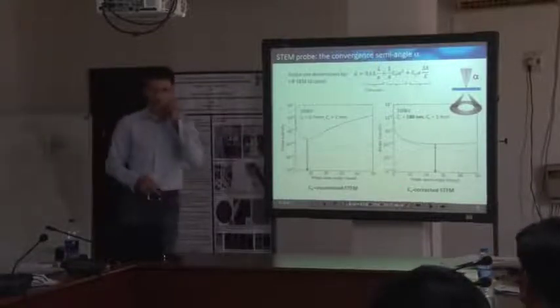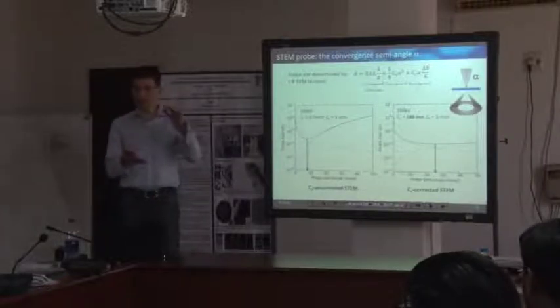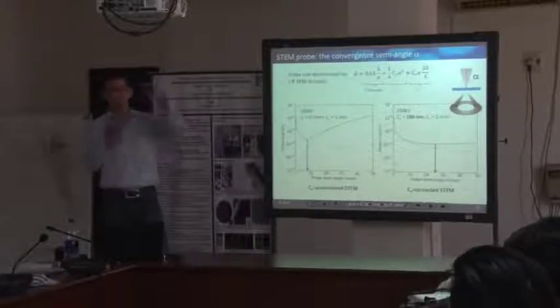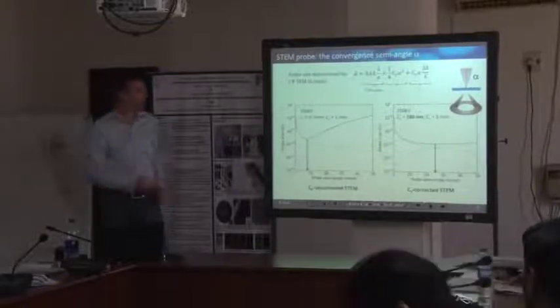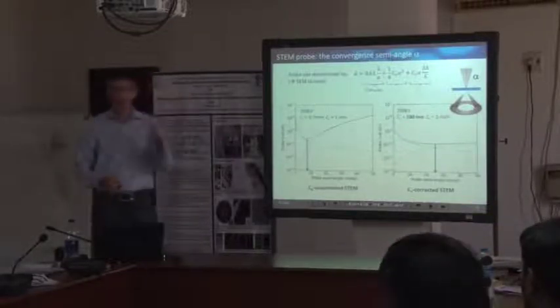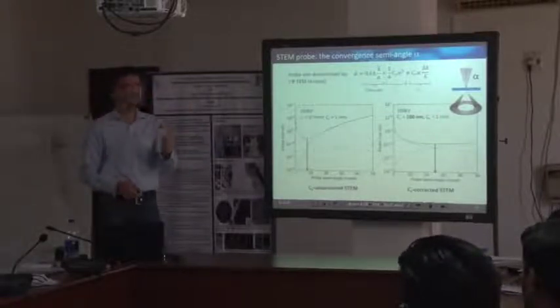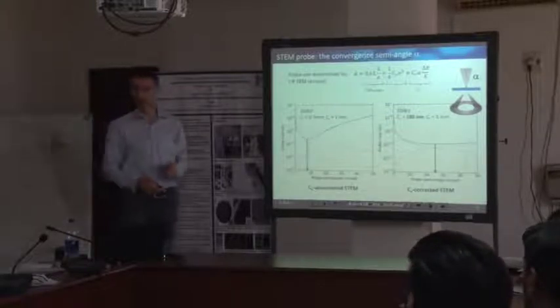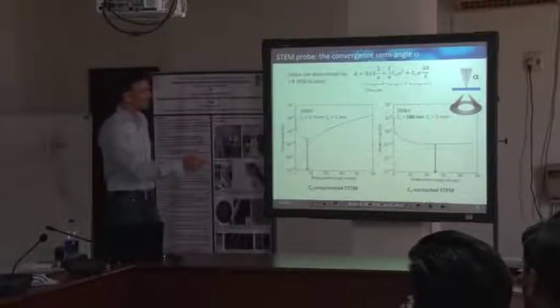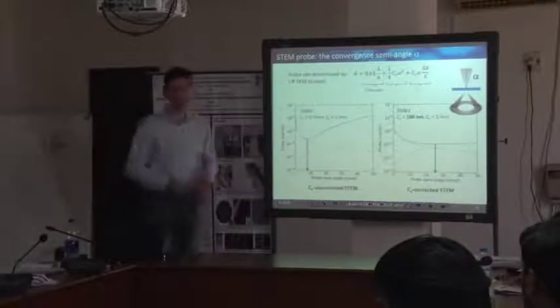With the Cs corrector, we already learned about the Cs corrector yesterday, we can use the same electron optical system. Instead of in the imaging system, we would just put it in our illumination system, to compensate for the Cs of our objective lens, to find an even finer probe on the sample. It's just to form a smaller probe on the sample with a higher current for atomic resolution imaging and spectroscopy. And this is the curve for a microscope with a very small value of Cs, just by compensating or correcting for this value of the objective lens.